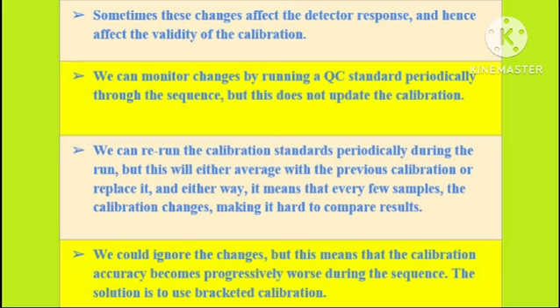That means during the analysis, errors can occur like pressure fluctuations, column leakage, etc. The bracketing standard has to be compared with the system suitability injections to ensure the entire analysis completed without any interruptions like those mentioned above, because we need to know the HPLC or GC system is working perfectly till the last sample.